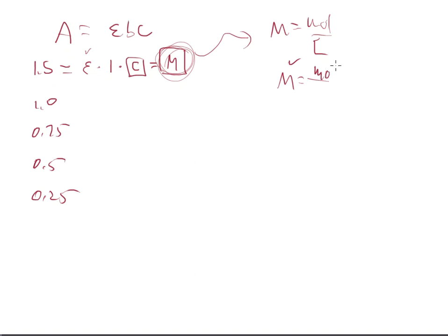So I'm going to solve for moles because that's the amount of caffeine I need to weigh out. And then with my liter, again, you pick the standard amount. You want to make 50 mLs? We'll put 0.05 there. You want to make 100 mLs? We'll put 0.1 here. Right? You do that. You do you.